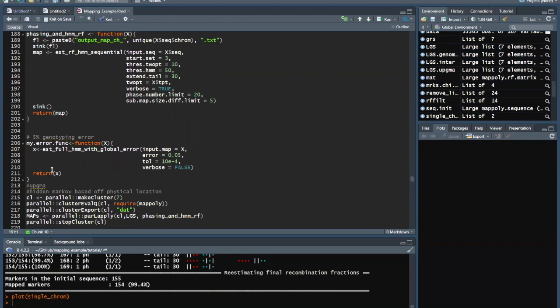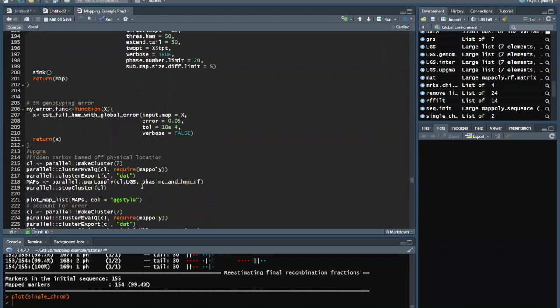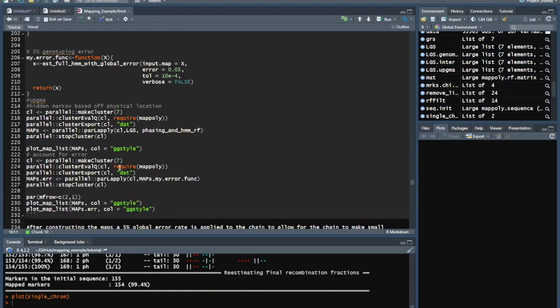All right, if you have less than 8 cores, come down to line 215 and put this. If the person that has less than 8 cores, do you have 4 cores or 6 cores, or it's going to take you a little longer? So you have 4 cores.